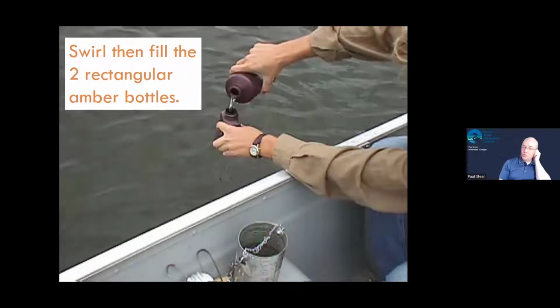Okay, so once you have enough water and not too much water in that big amber vial, give it some swirls, some gentle mixing, and then you're going to fill up your 2 rectangular amber bottles. These are smaller bottles that will come with your kit. You will fill those up.